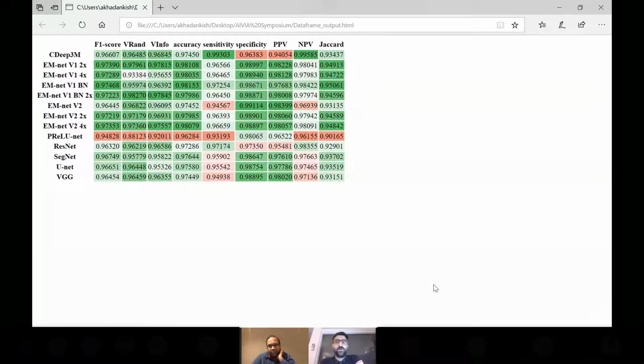What happens in Colab is on the notebook, but when you run the script, we were interested in giving the user two different outputs: one data table representing different scores, and the other one, I hope this time you can see my screen, is the heat map that Vijay also showed to you during the presentation.